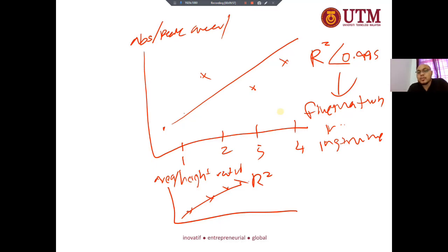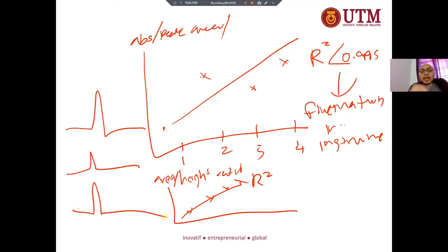But if you have the problem with the fluctuation of the instrumentation reading, suddenly the peak becomes higher, then suddenly the peak becomes low, or suddenly higher again, then you need to use the area or height ratio, or the internal standard calibration method, to compensate for this problem. If you perform the analysis of a complex matrix sample and you have the problem of fluctuation as well, you need to combine the internal standard method and also the standard addition.